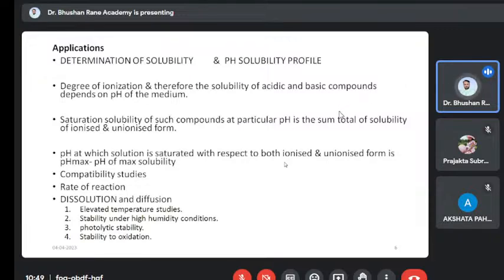After 30 minutes, 1 hour, 2 hours, you can see in the spectra a decrease in the intensity of A and B at 230 and 250 nanometer, and an appearance of a peak at 300 nanometer, which indicates the formation of the reaction product, C.